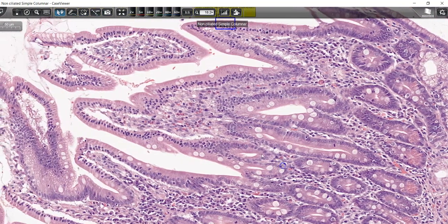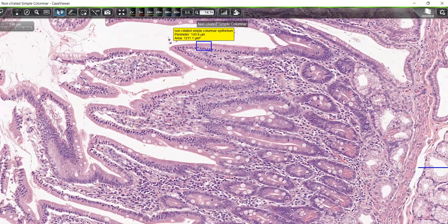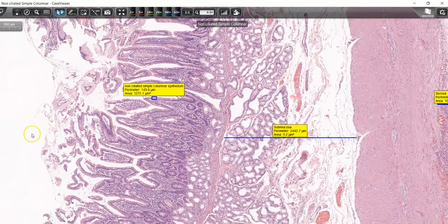These intestinal glands have an important role in the formation of goblet cells. Moving towards the lumen, the mucosa layer also consists of epithelial fold and lamina propria. Part of lamina propria and this epithelial fold will form a finger-like projection, which is also known as villi, that extend towards the lumen of the duodenum.